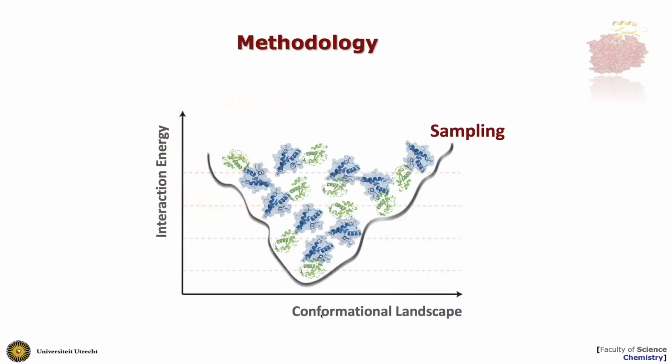Now, you have this interaction landscape, so interaction space between the molecules, and everything here is represented as a two-body system, so two molecules, but many assemblies consist of more than two molecules. So you need also to be able to go to larger assemblies and a larger number of molecules to deal with, which increases, of course, greatly the complexity of the problem.